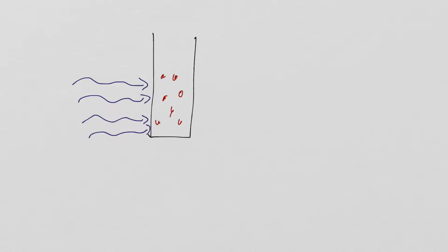It should not absorb the light, because that's pretty pointless then. And let's say our red dots will absorb the light. Not all of the light. Some of the light will go through. So let's say what we see is that 2 of the light goes through, so 50% of the light goes through. Okay?